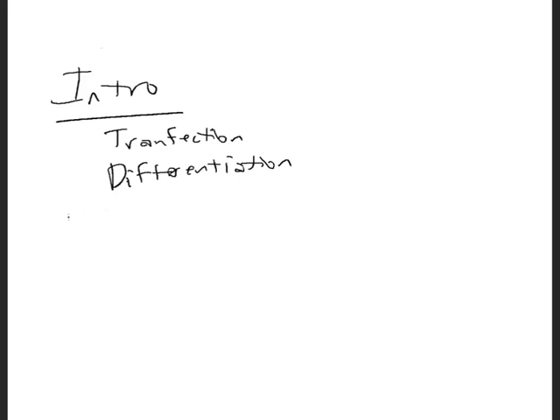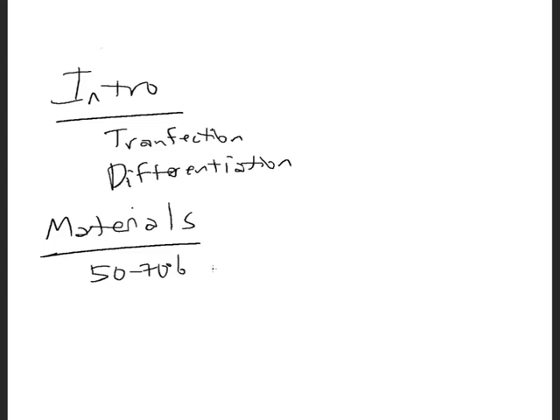Okay. As far as the materials and methods section, basically describe the fundamentals of the transfection protocol. So let's go over those again real quick. Basically, you culture your cells so they're about 50 to 70% confluent. That's the basic standard, and as long as they're within that range, you can do the transfection protocol. You basically take a small amount of DNA. So make sure you know that you've got the control GFP and you've got the plin2.